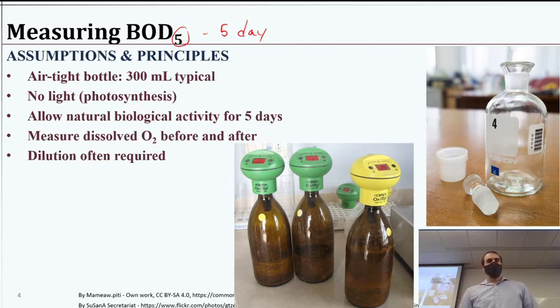Okay, so how do we do it? Well, we're going to take a sealed bottle, and I've got a couple pictures from online here that are typical BOD bottles. So the common practice is to use something about this size. These are 300 milliliters, and that's just the typical size. We could do different, but pretty much all the problems I'll give you, that'll be the total volume that we would work with.